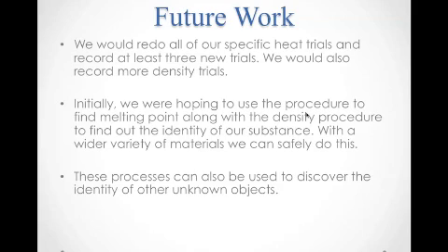So in the future, we would probably redo our specific heat capacity trials and calculations and hopefully obtain a more accurate value that could more easily confirm the identity of our metal, and possibly find the melting point of our mystery metal, which we couldn't do because the thermometers provided to us couldn't handle high temperatures, and since the lab equipment wasn't ours to break, we decided to measure specific heat.